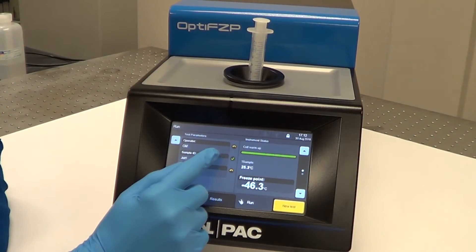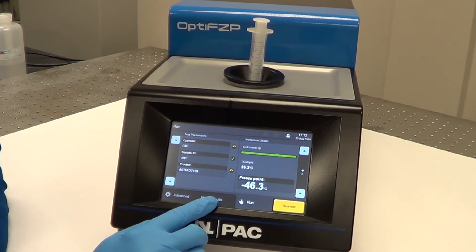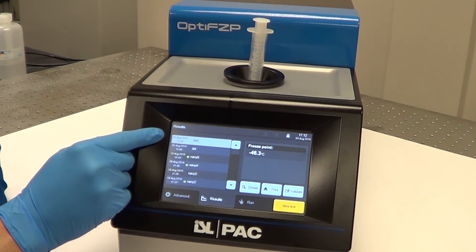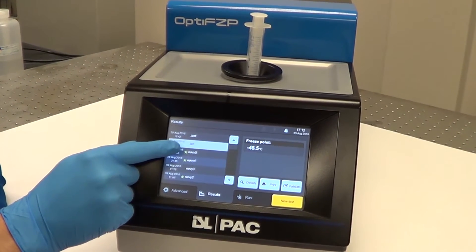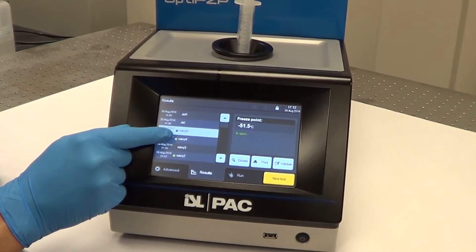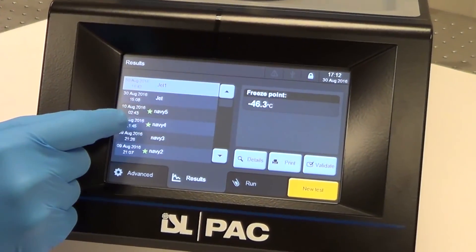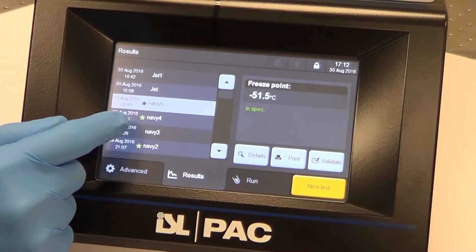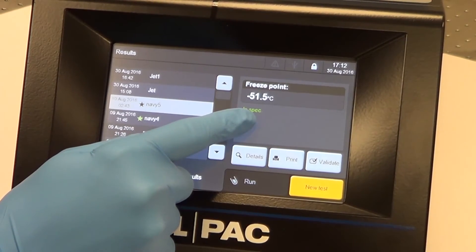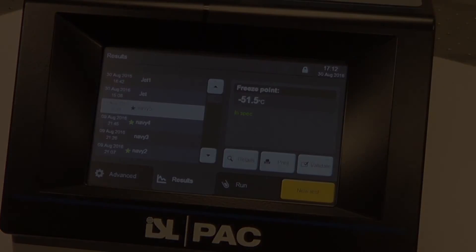Now that our test is completed, you can see your results here on the main screen. You can also go to the results tab, and your recently completed test will be here at the top. For previous results, you can just work your way back through the list. You can have a standard test result, or if you have a minimum and a maximum established, it will tell you in spec or out of spec.